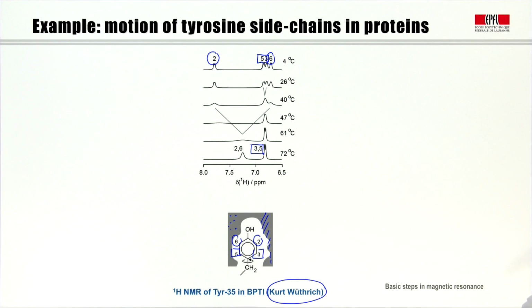Now that implies that the protein must be dynamic, that it must be able to breathe, as it were, in order to leave sufficient room for such an exchange process. Indeed, quite a remarkable observation.